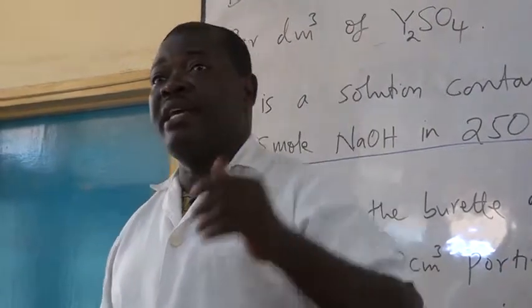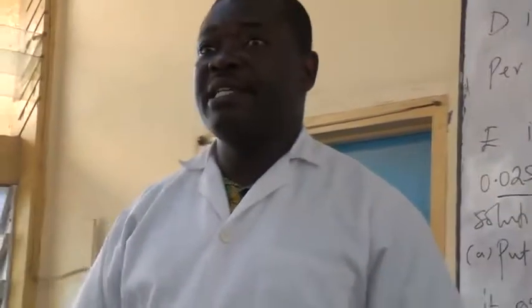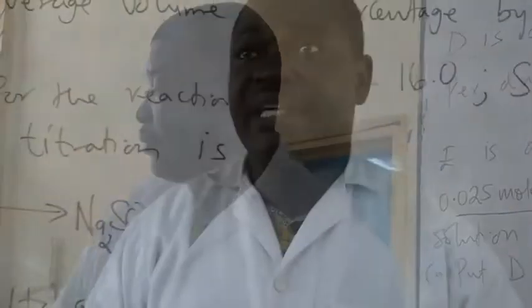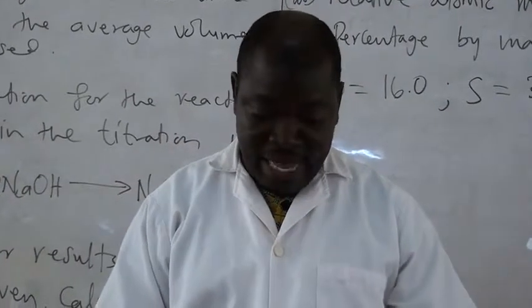If it's been labeled A and B as you got last week, please just use a pencil to relabel it D and E. You can wipe it up and label it D and E. Titration shouldn't take you that long. Then of course we start with the calculation.